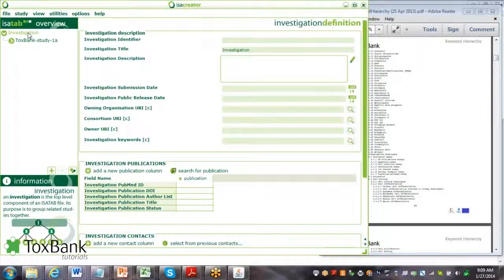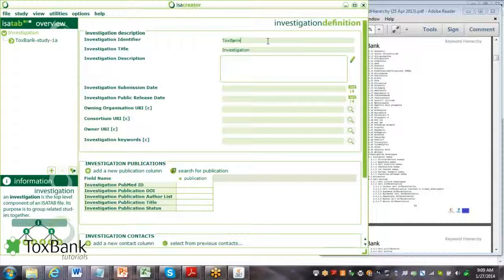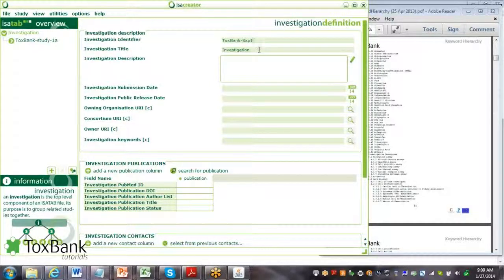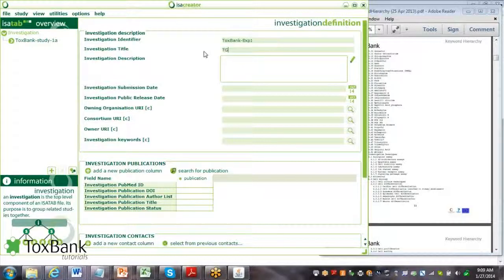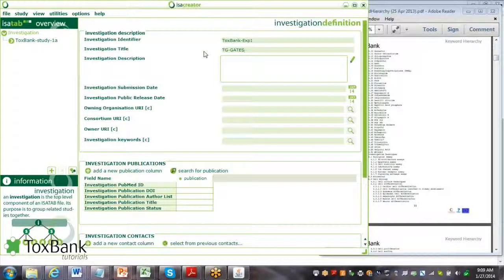The first step is to provide some sort of identifier that you used internally. Then give it the title of the investigation. For this one, I'll just use the TG Gates example.